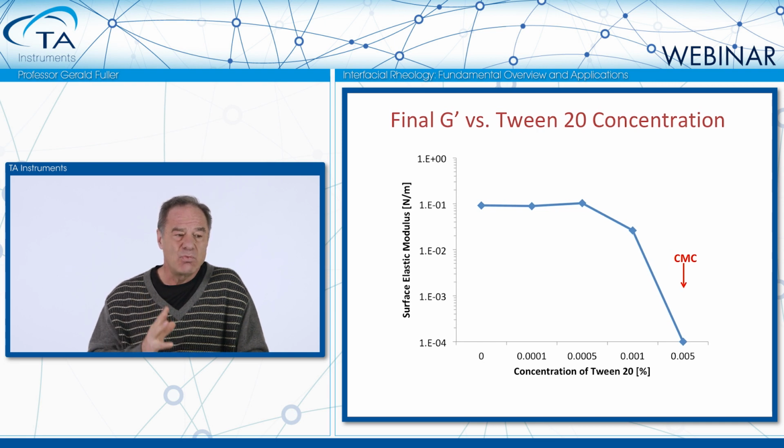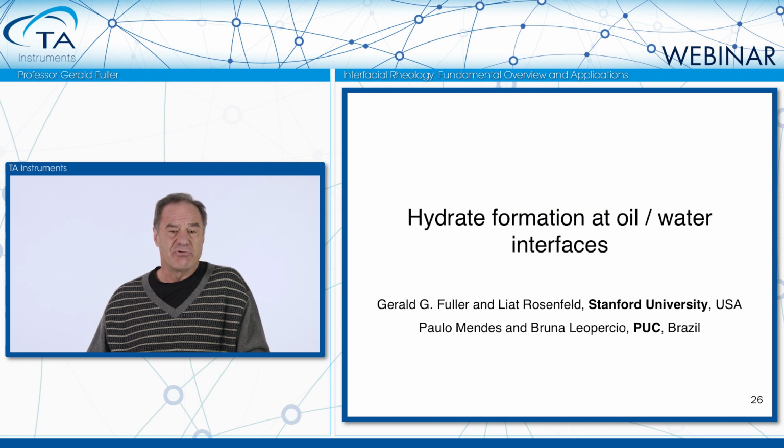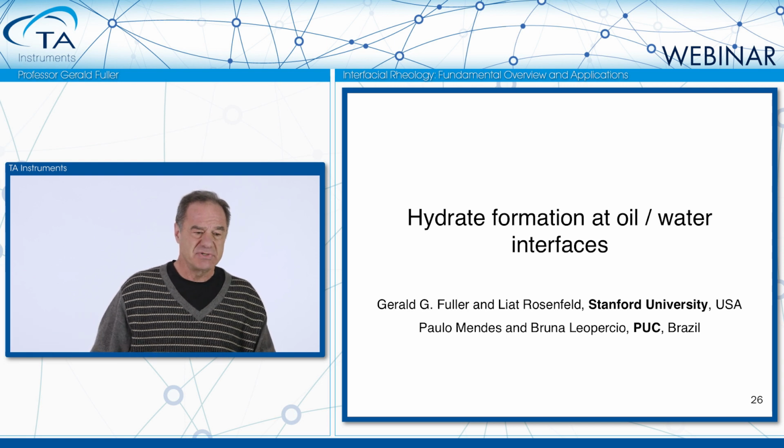So again, this is a way, using this instrument, to do some chemistry and to systematically vary the concentration of chemicals that you might want to interfere with interfacial viscoelasticity. Hydrates. Now moving into the oil industry.